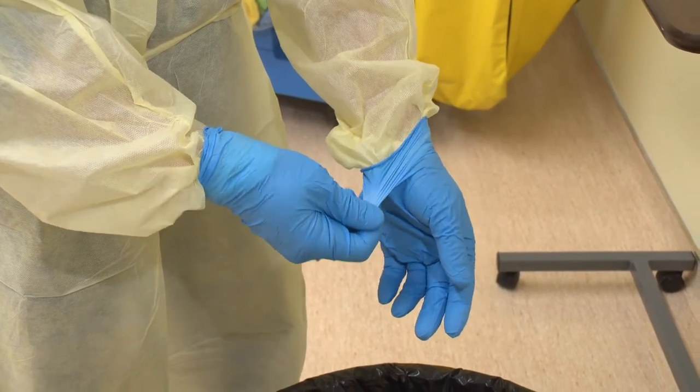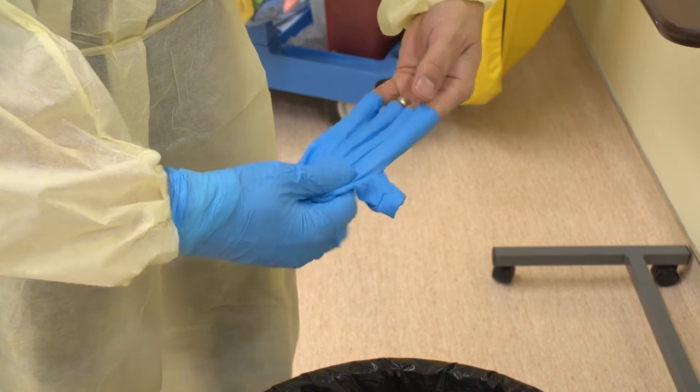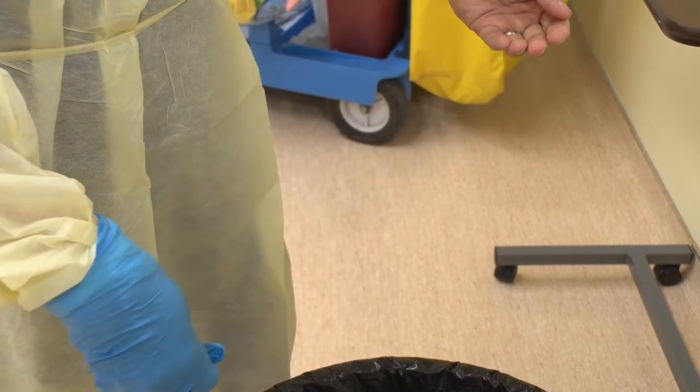Grasp the outside edge of one glove near your wrist and peel it away, rolling the glove inside out. Hold that balled-up glove in your gloved hand.